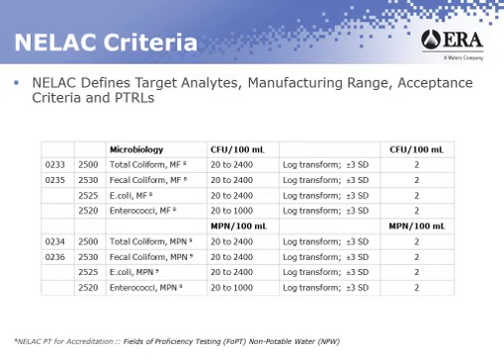It's the level at which the lowest acceptable result could be obtained from the lowest spike level. So if we were to manufacture a given lot at the very low end of the range, you should not expect to see an acceptance range that would go below 2. So it's never going to go down to 0 or 1.